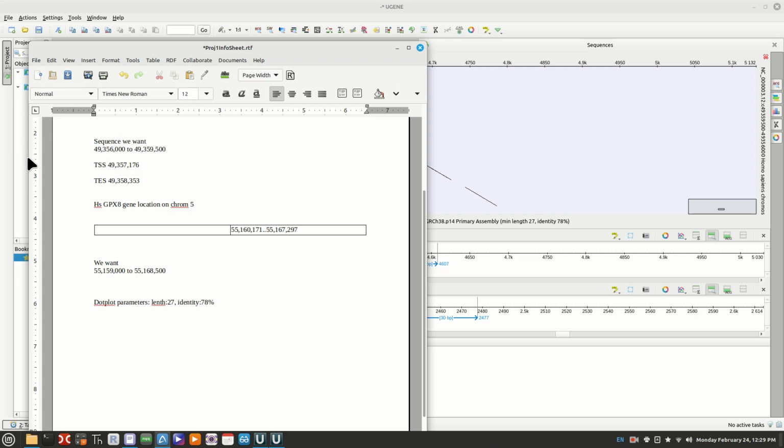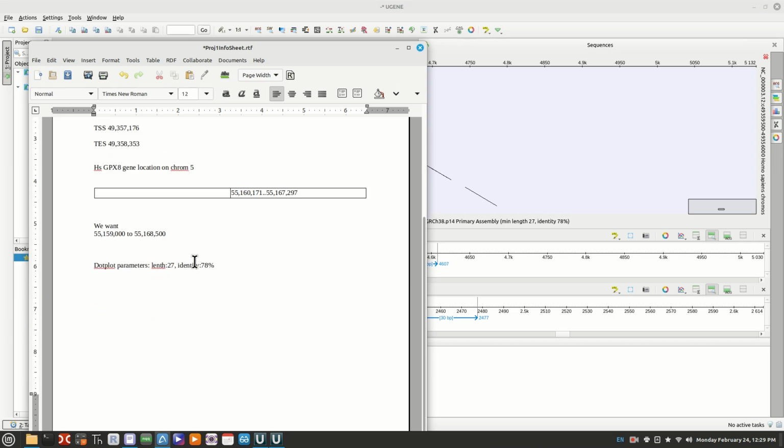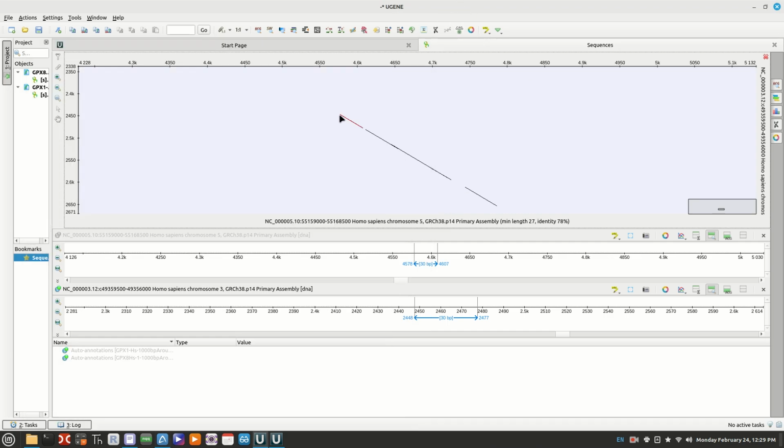You might go, I know which ones we're doing. We're doing this one and this one. So in that region, the region of interest, we'll look at it from X and Y. When I do this, it says the X region, which is the one across the top or bottom, is at 4578. So we need to record that: 4578.